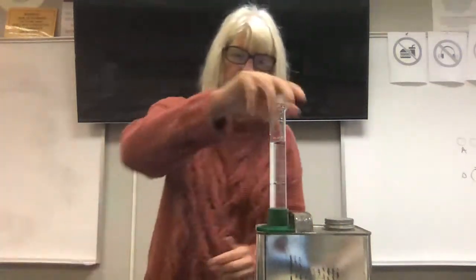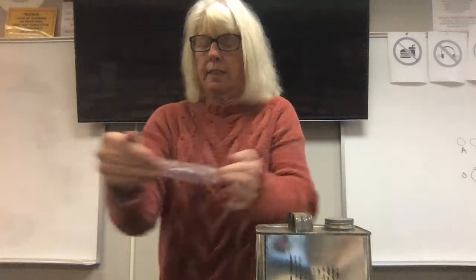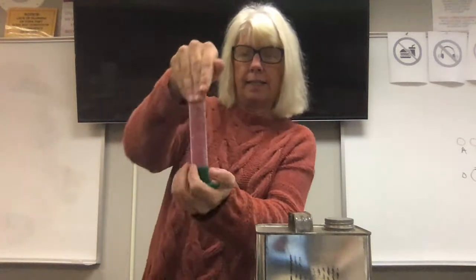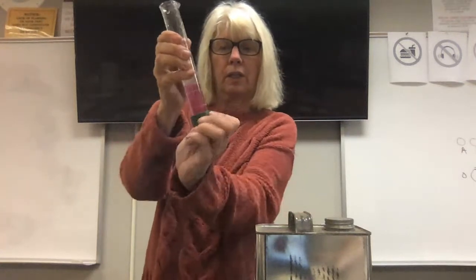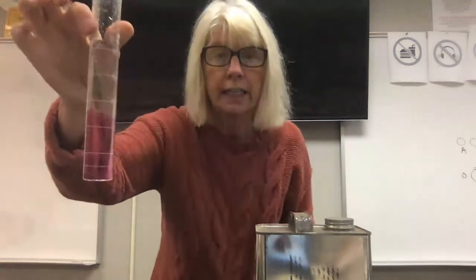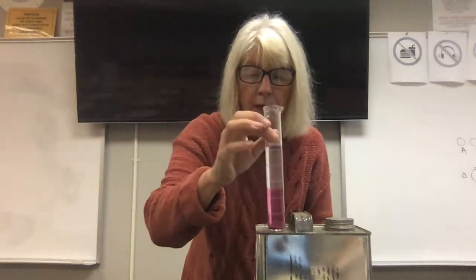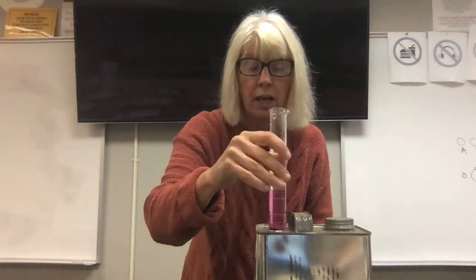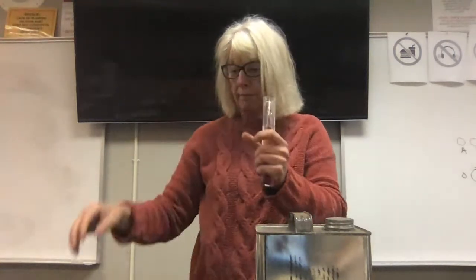Let me shake it up first. Do you see how the iodine is located in the bottom layer? That's a good indicator that it's the TTE that is on the bottom.